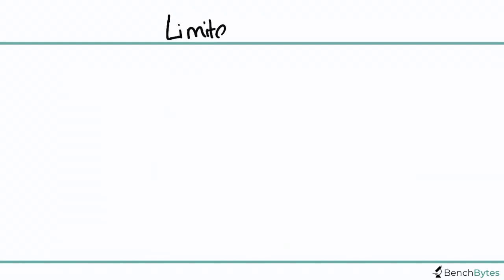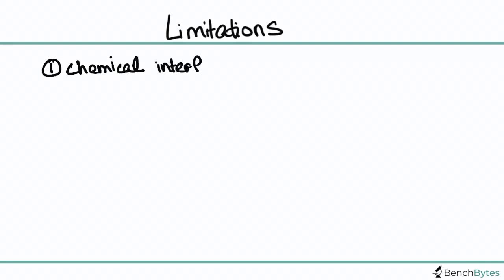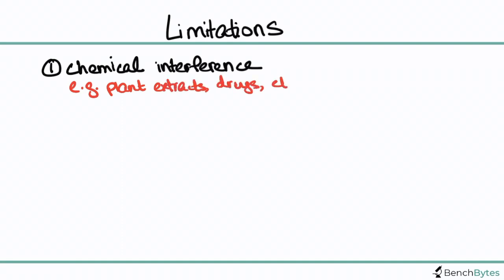I also want to touch on the limitations of this assay. While it's a wonderful assay, it does have some pretty significant limitations. One of these is that it can be affected by any sort of chemical interference that affects metabolism. You need to be careful about what kinds of drugs or compounds you're screening — for example, some plant derivatives, vitamin A, and certain toxins all inhibit metabolism and will affect what your MTT assay reads out.